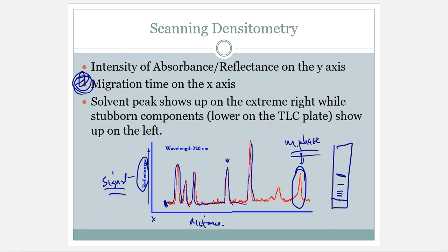So if it's straight up ethanol, if it's straight up methanol, we probably won't see an absorbance assigned there, but it's still going to show up in some form or fashion, and we still might see a tiny little peak because of contamination. So these things are not going to be super, super clean sometimes. There's going to be impurities that are there, and those impurities can show up on these UV-vis spectrums, because that's kind of what they are. It's just in a different perspective. That's all that these densitometry reads are going to be about.